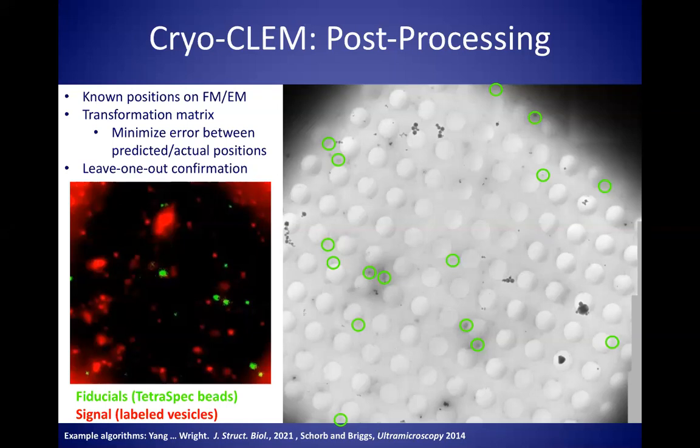How this works is we take one of the fiducial points, for example, this one right here in the center, and we remove it from the calculation. And this allows us to recompute the transformation and then predict where that point would be. And this gives you a more certain estimate of your actual error, because this calculated error tends to be a little overly optimistic.